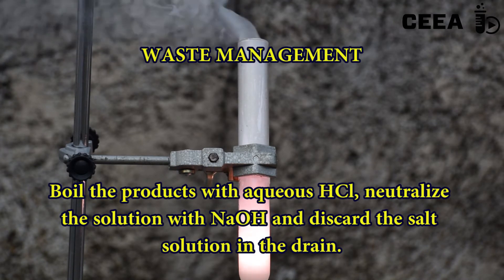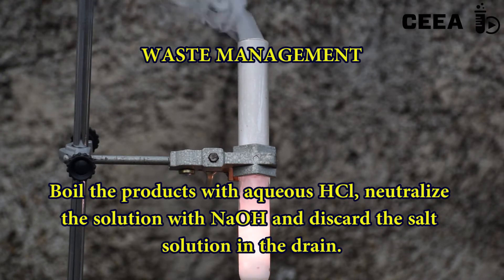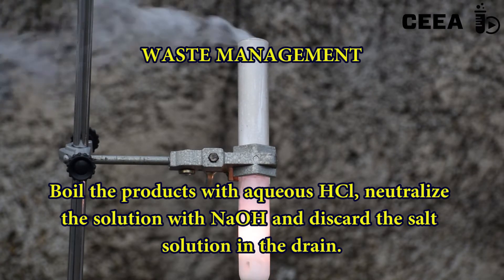To discard the reagents, the reaction products are treated with hydrochloric acid and then neutralized before discarding them in the drain.